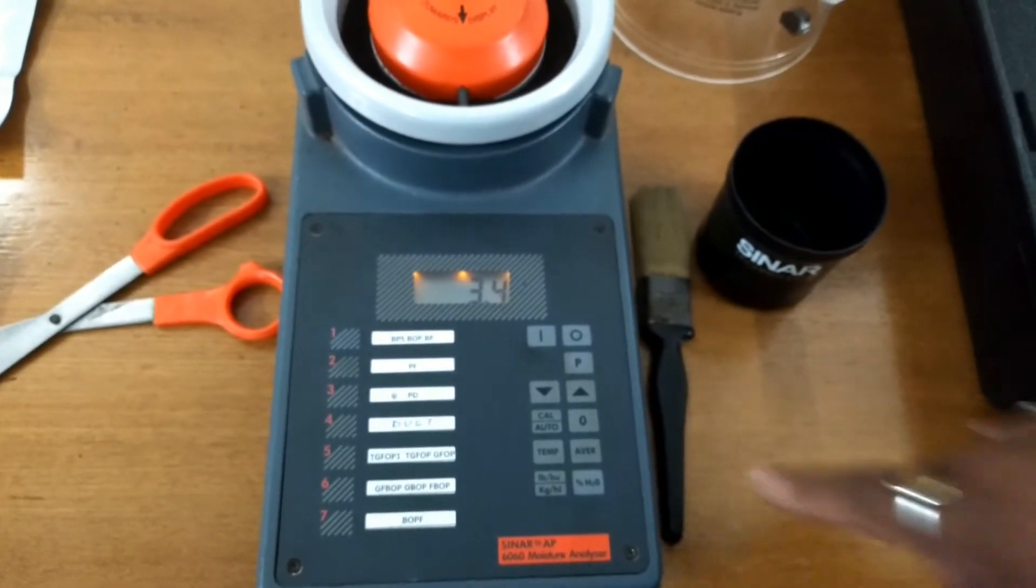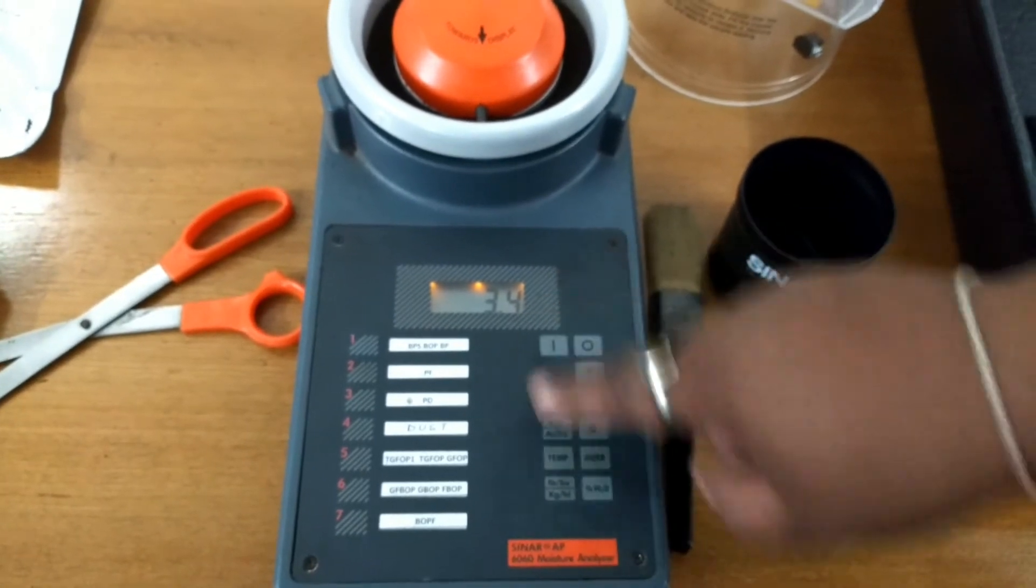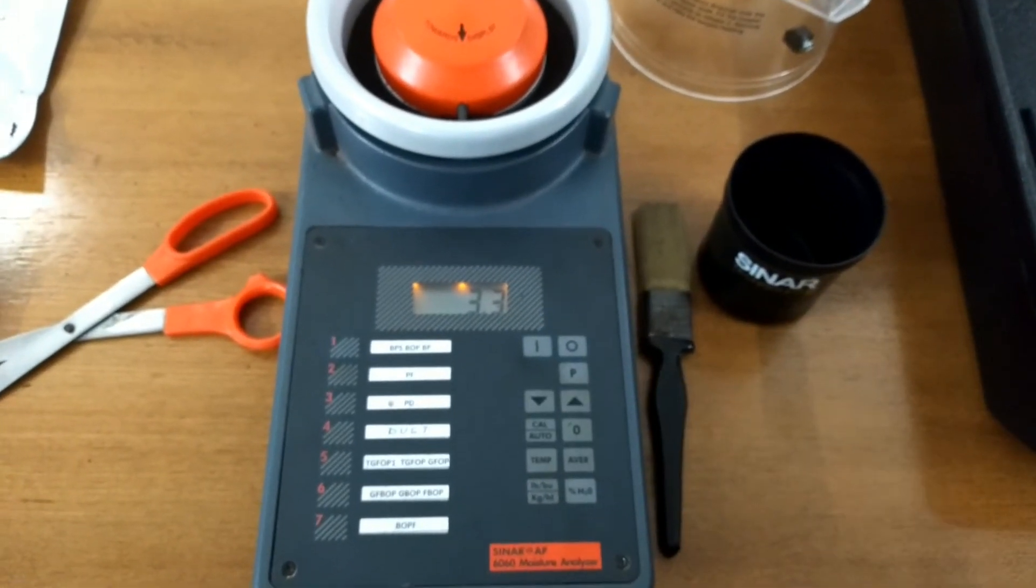It shows 3.4. I need to adjust to 3.3, so I adjust it by using these keys, the up and down keys. In this case, I have to reduce it, so I do 3.3.